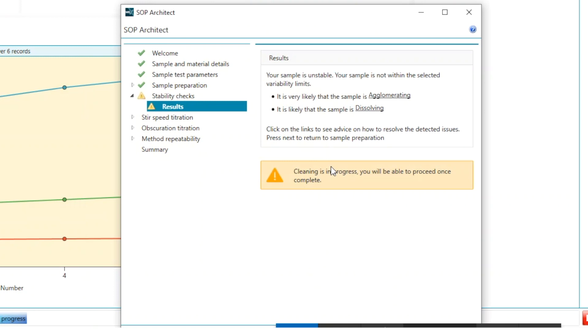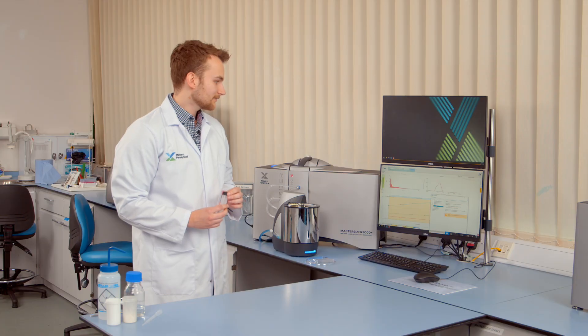Now if we look back into the SOP Architect feature we'll be able to see what the feedback is. So the SOP Architect is informing us that our sample is not stable and is in fact likely to be agglomerating or possibly dissolving. So what we'll need to do now is try and fix our dispersion by perhaps adding in an additive which we'll do to reassess the stability checks.